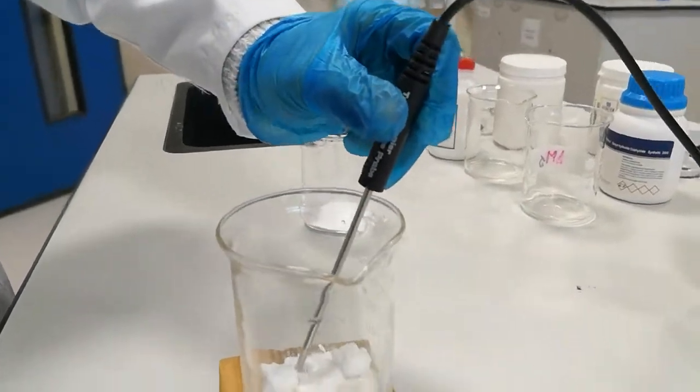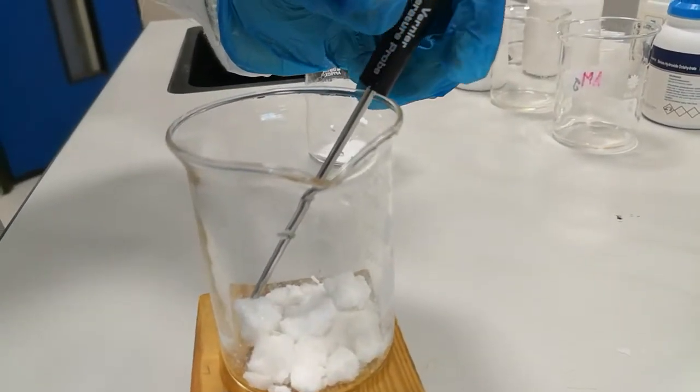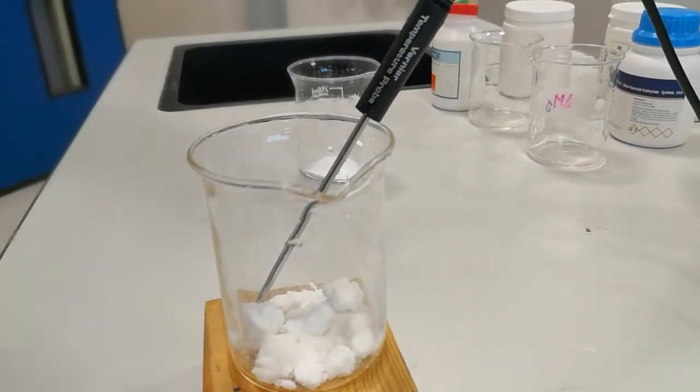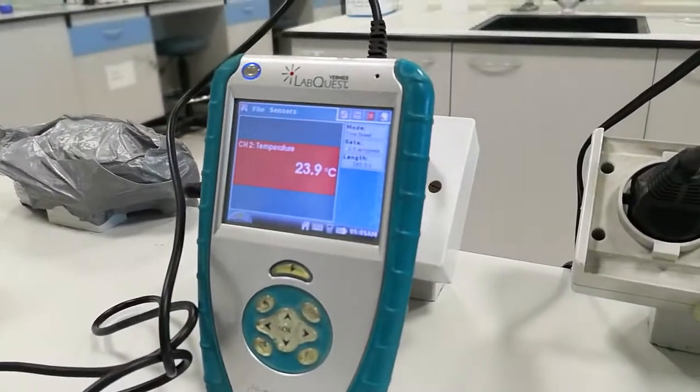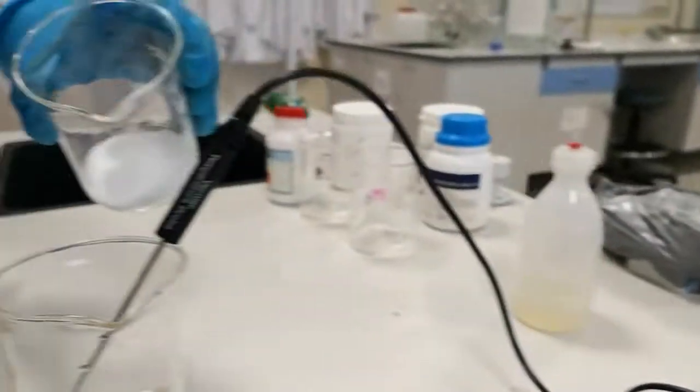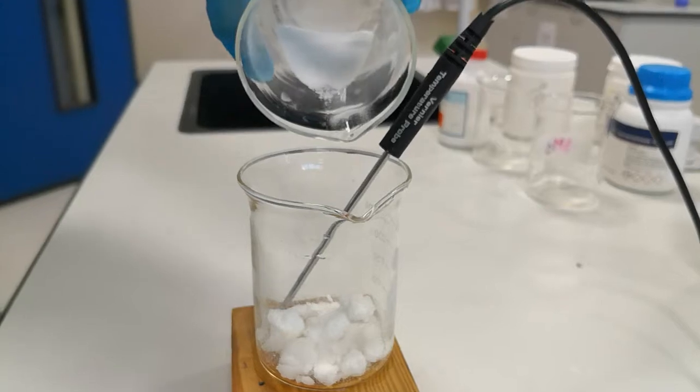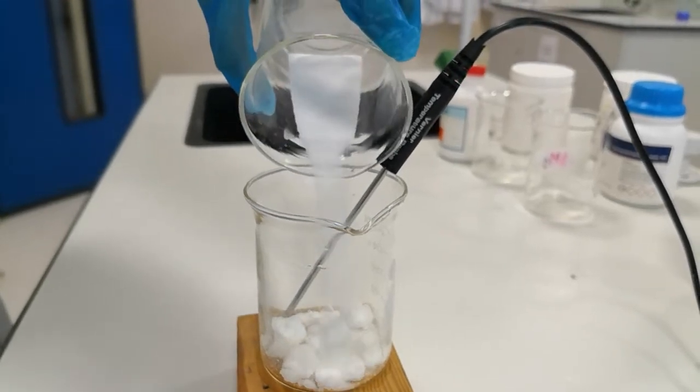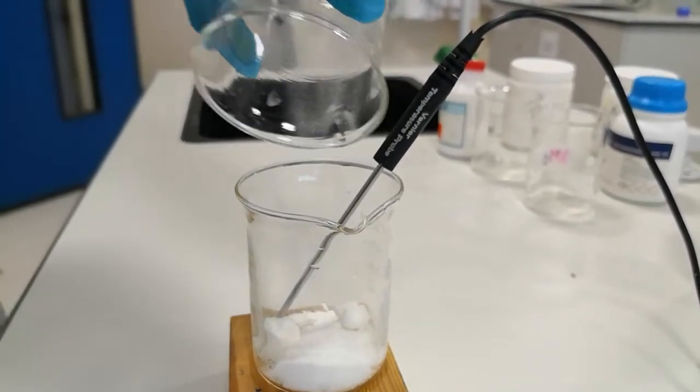I am placing the temperature sensor to record the temperature before the beginning of the chemical reaction. It is now around 24 degrees Celsius. So now I am going to add the ammonium chloride.